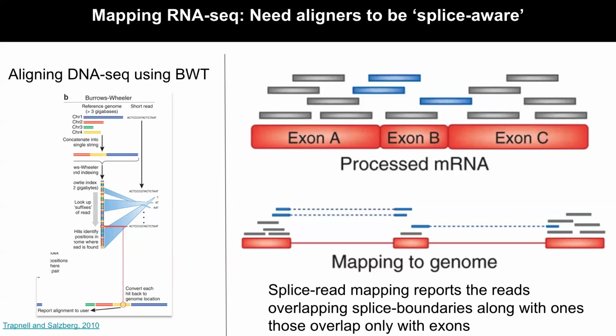Okay. So the read that I get, it's possible, this is your entire sequence of the read. It's quite possible that this half came from this half and the other half came from this other. So one read, one DNA sequence, how do you figure out where exactly it came from, this particular location? That's the main problem that we have to be aware of.